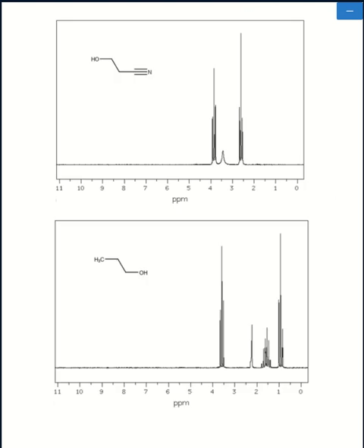Now, as far as the rest of the molecules, they're going to more or less follow the n+1 rule, and potentially you might see symmetry, where if it's the exact same hydrogen environment symmetry, then just give it the same label.